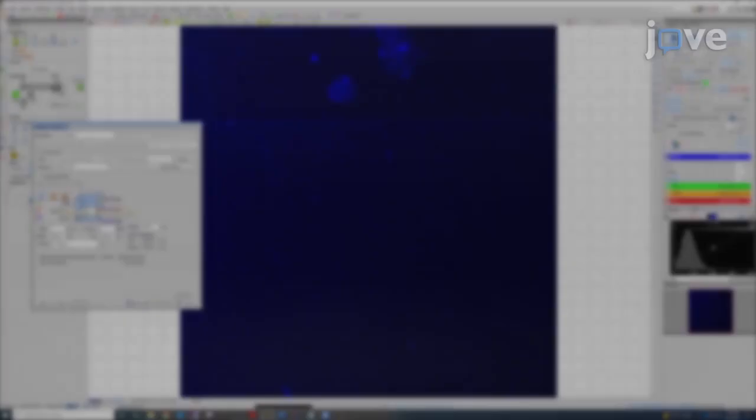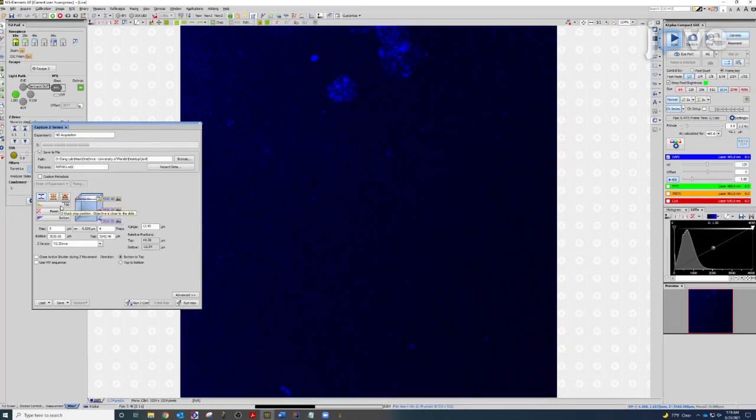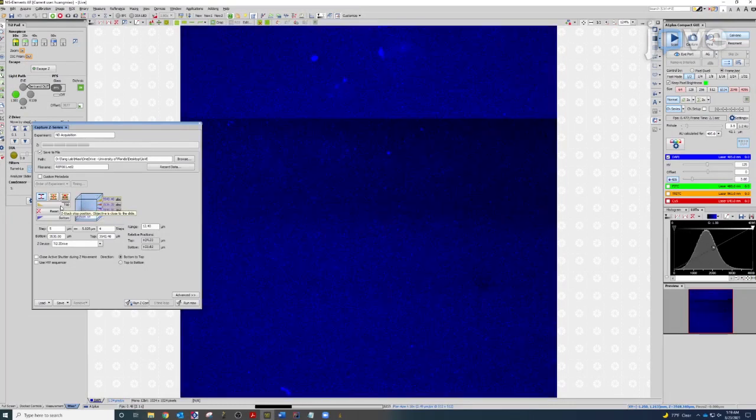This method will help elucidate molecular mechanisms of multifaceted biological phenomena, such as mechanobiology, optical electrophysiology, and super-resolution DNA, RNA, protein imaging, using automatic live cell imaging techniques. This protocol enables automatic, multifunctional, high-throughput, self-drift correcting, and long-term image acquisition. It is compatible with most fluorescent microscopy platforms, such as Nikon.